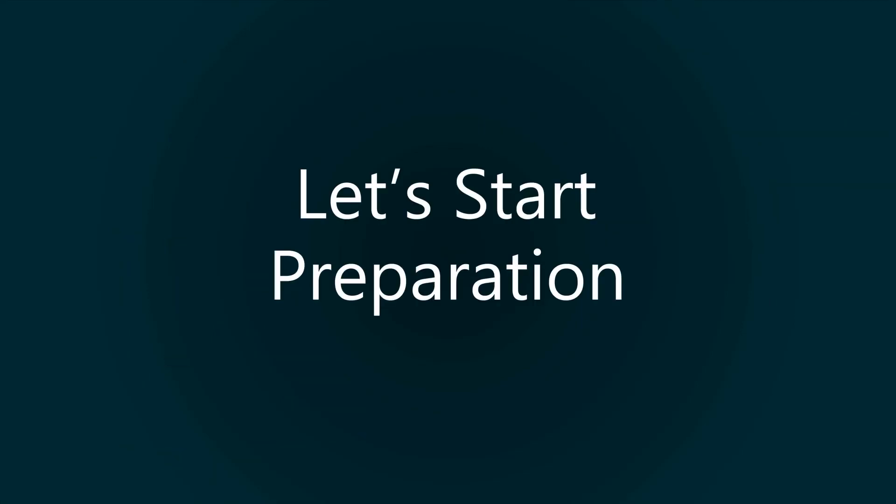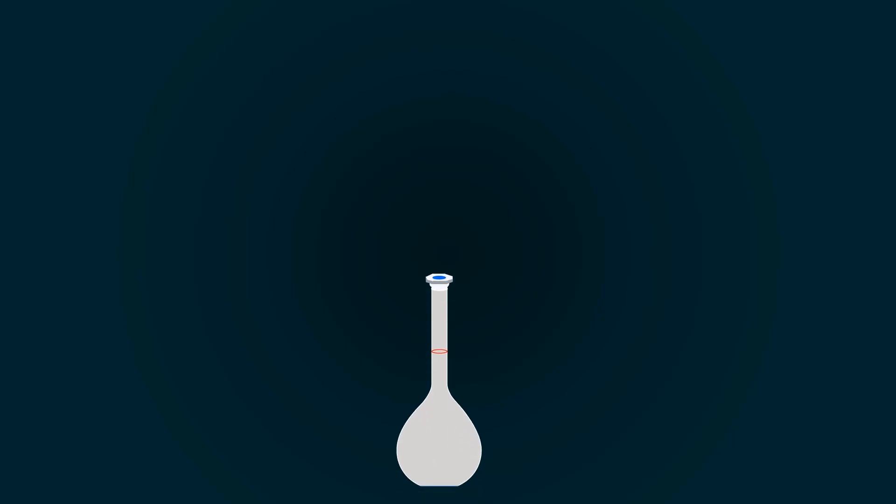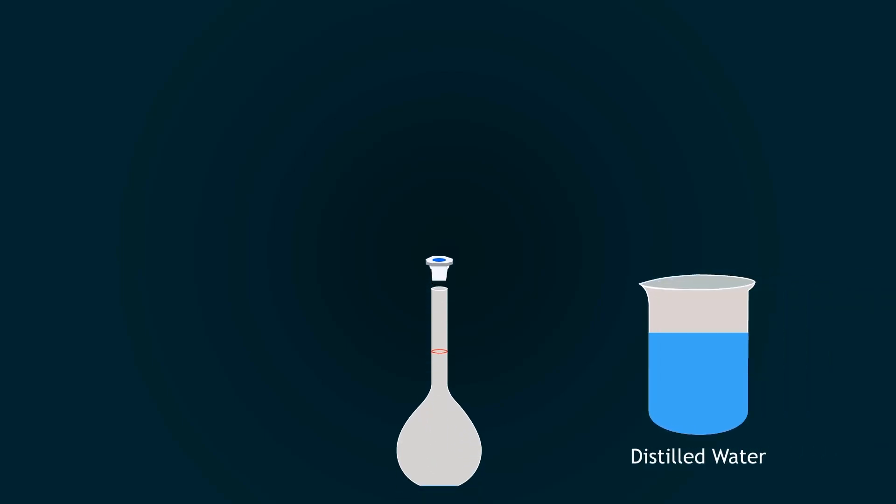Let's start preparation. First of all, take a 500ml volumetric flask and add some distilled water into it with the help of a funnel.